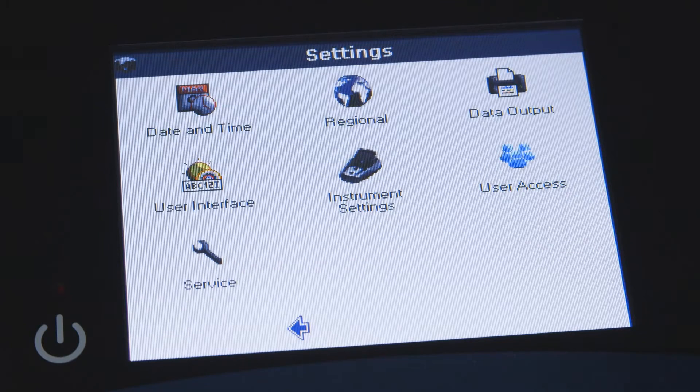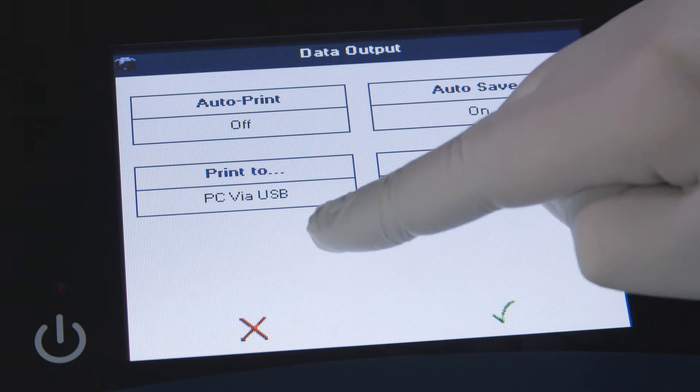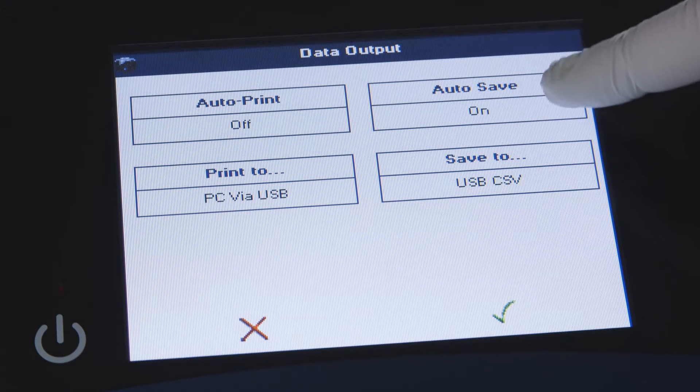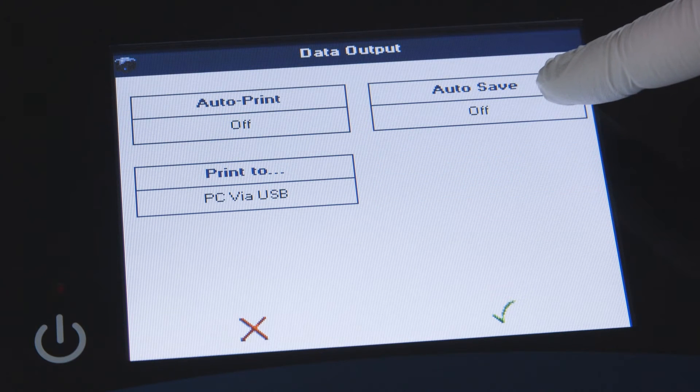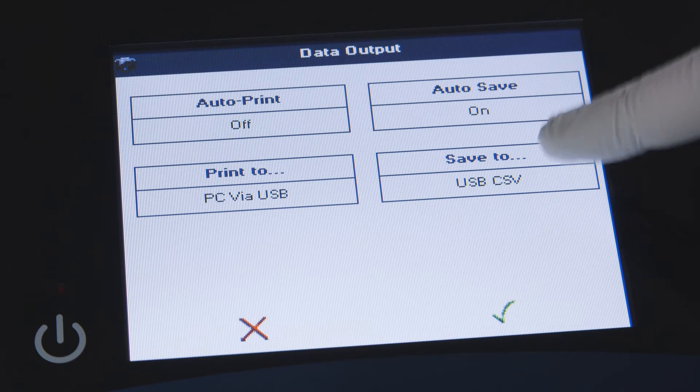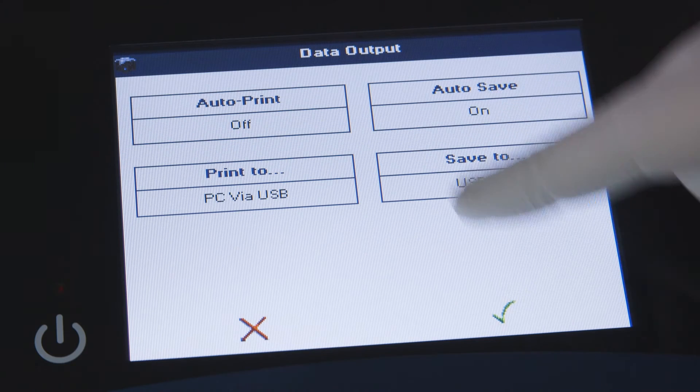The data output icon will allow you to specify where you would like to have the instrument auto print data. You may also specify auto save settings for data and methods.